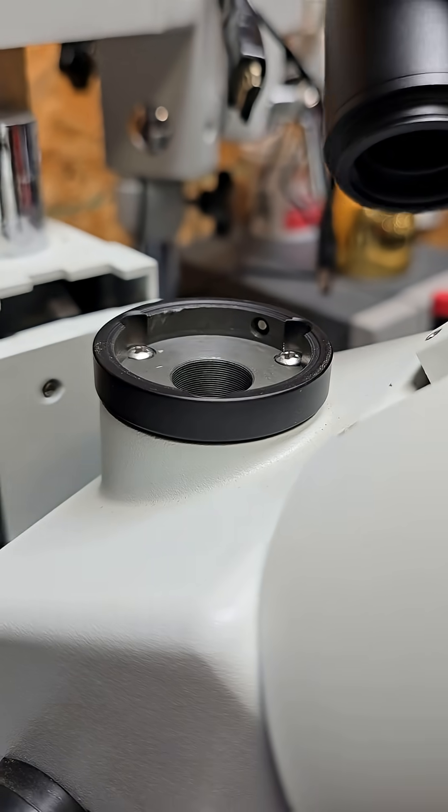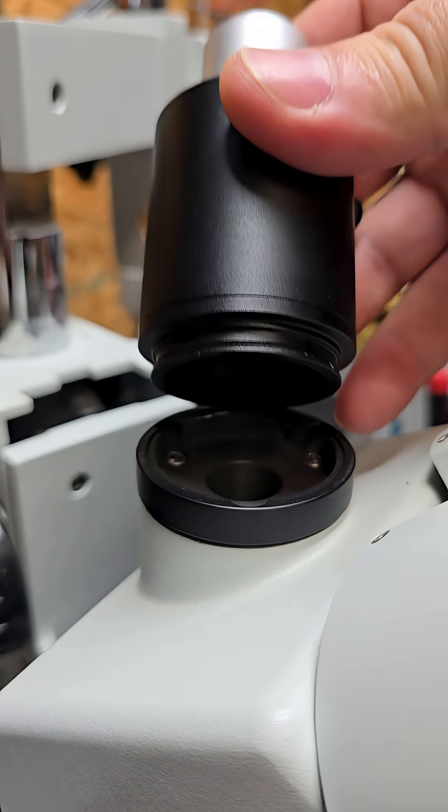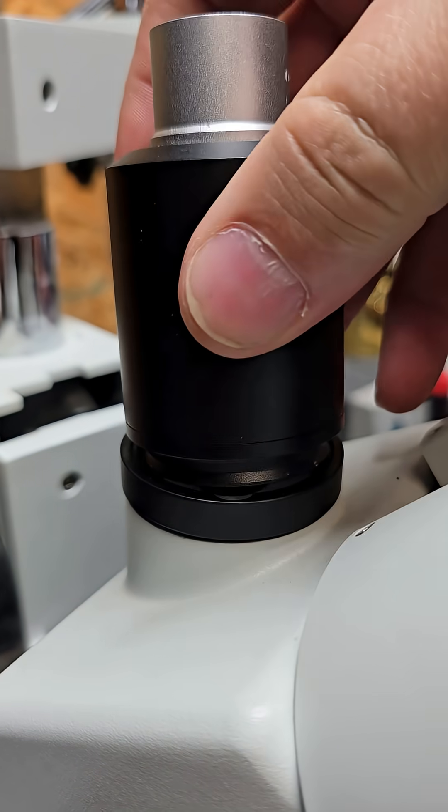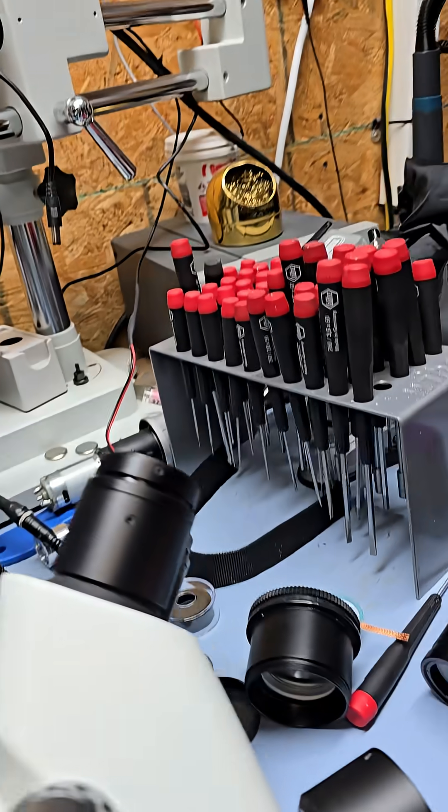That is AmScope, right? That base, the tapered ring, they call it AmScope.